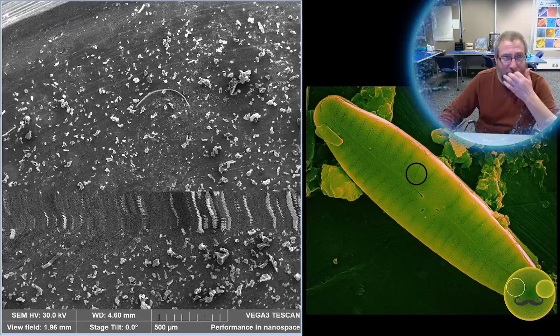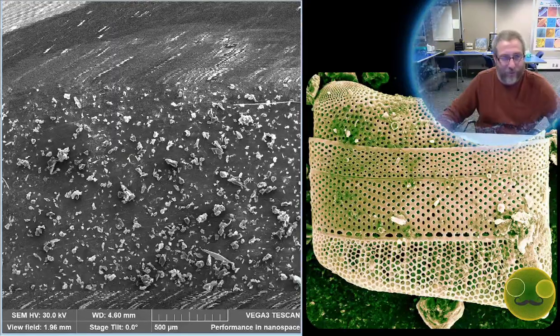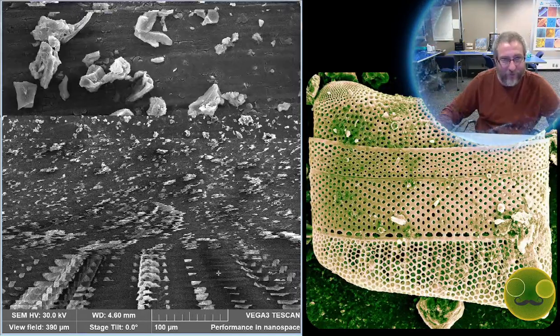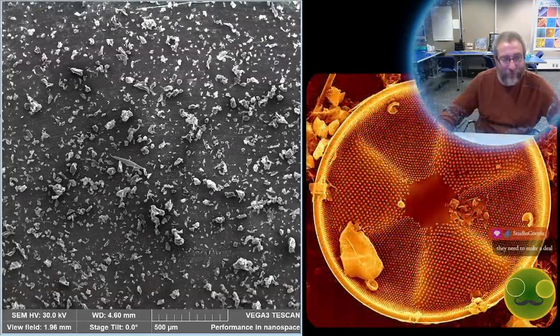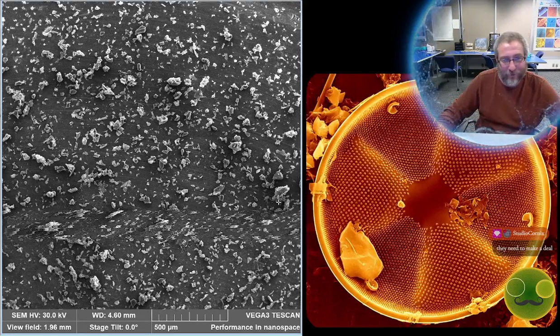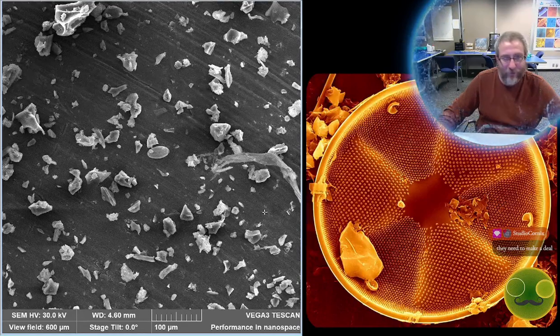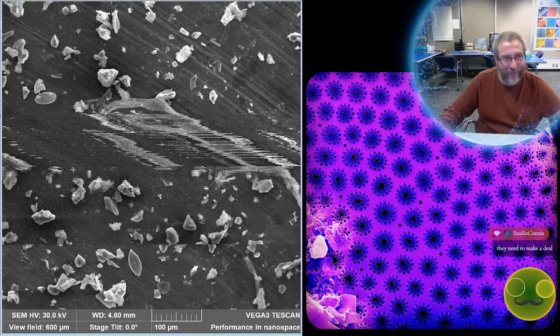But it's not part of the organism, it's a separate organism, and when they grow, they have to acquire them. Or in the case of diatoms, when they clone, they probably split some of them between the two clones. So there's a custody battle that happens, you know, when the cell splits apart, that would result in shared material between them having to be moved. So hopefully there's enough of the endosymbiotic organism to basically be present in that environment. And that's probably another advantage of making your home a diatom, which is that they can split and split and split and split many times without you having to be exposed to the outside world at all, right? So you can just hide inside that diatom.